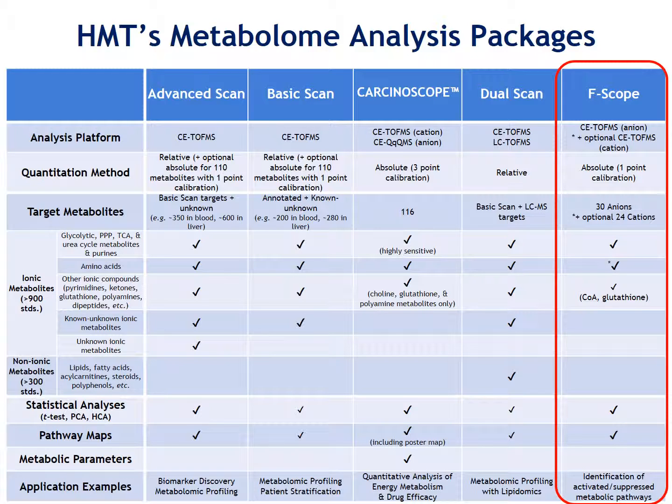These approaches can identify specific sensitive reactions for potential therapeutic intervention and mechanism of action studies. Due to our high-resolution technology, we can accurately detect and quantify the various isotopomer distributions using our F-scope platform.